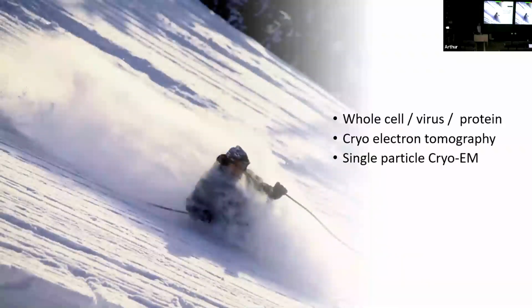So what are you looking at with cryo-EM? We're looking at whole cells. If they're thin enough, we can get virus particles, proteins. You can do tomography. You can do single particle. All of this is in the realm of cryo-EM.